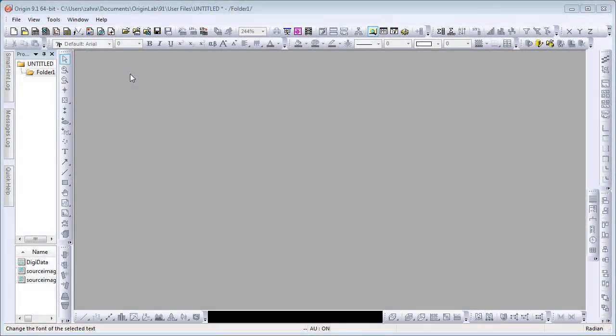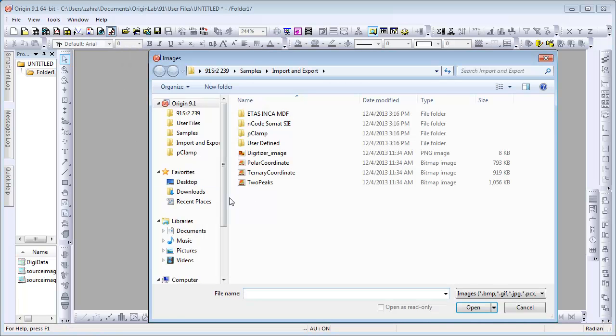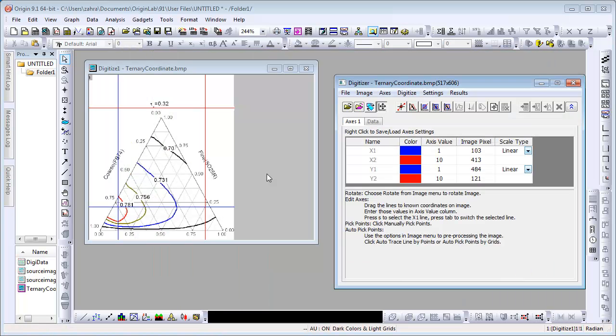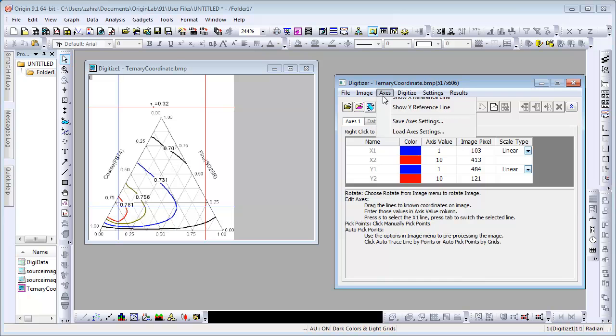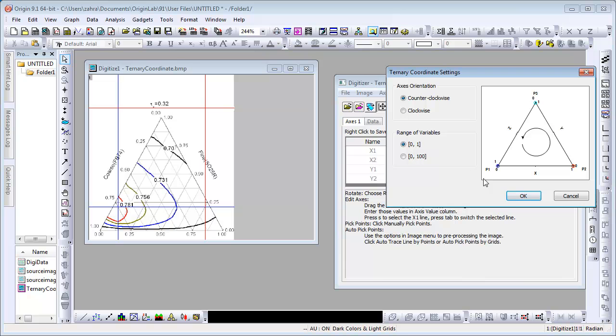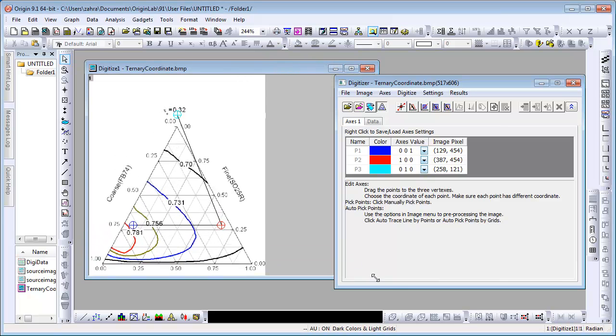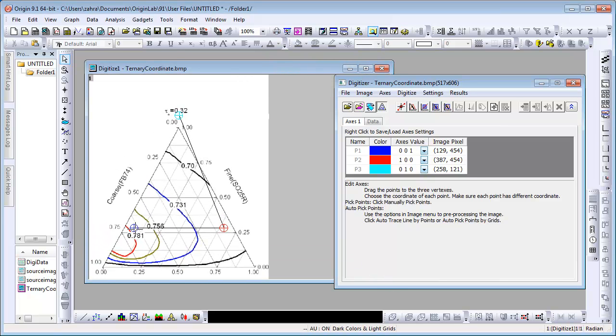We will also learn to digitize a Ternary coordinate plot image. Once again, change the coordinate system from Cartesian to Ternary from the Axis submenu. Save the axis orientation and range of variable default setting. Drag the three points to the vertices that they are closest to.